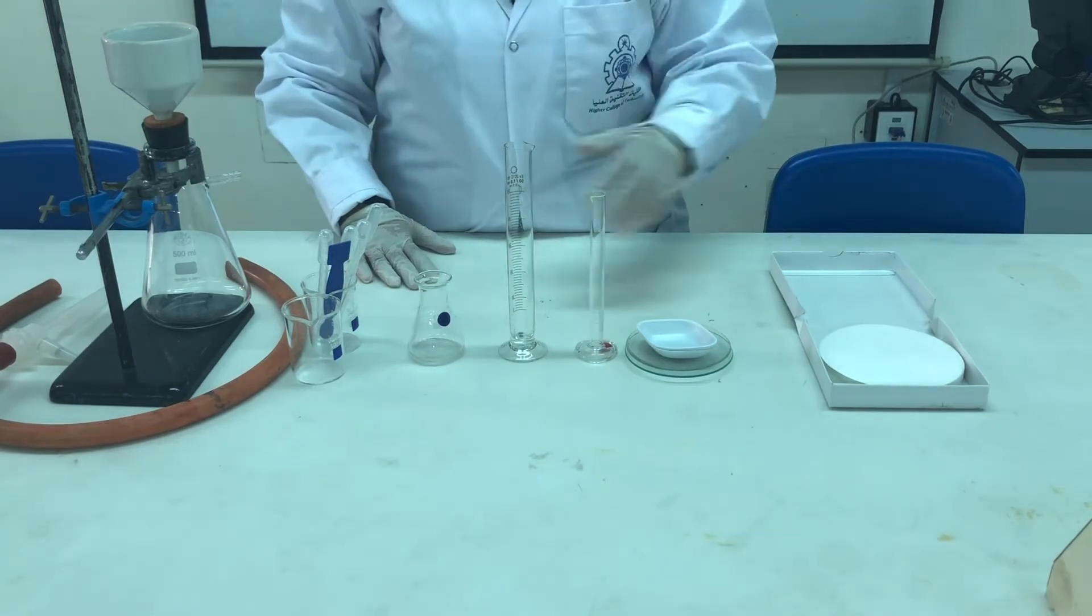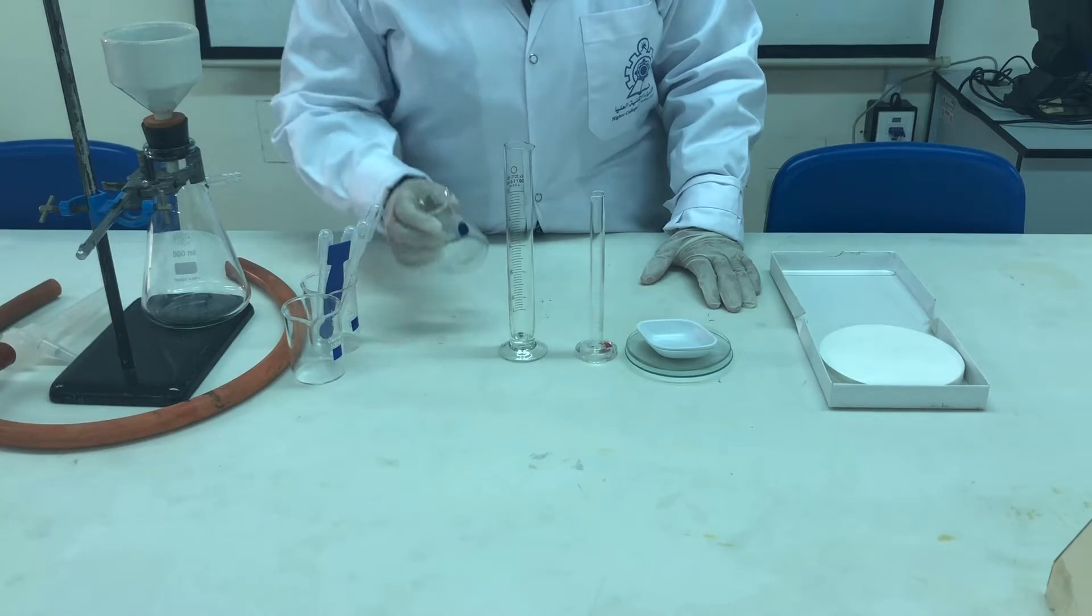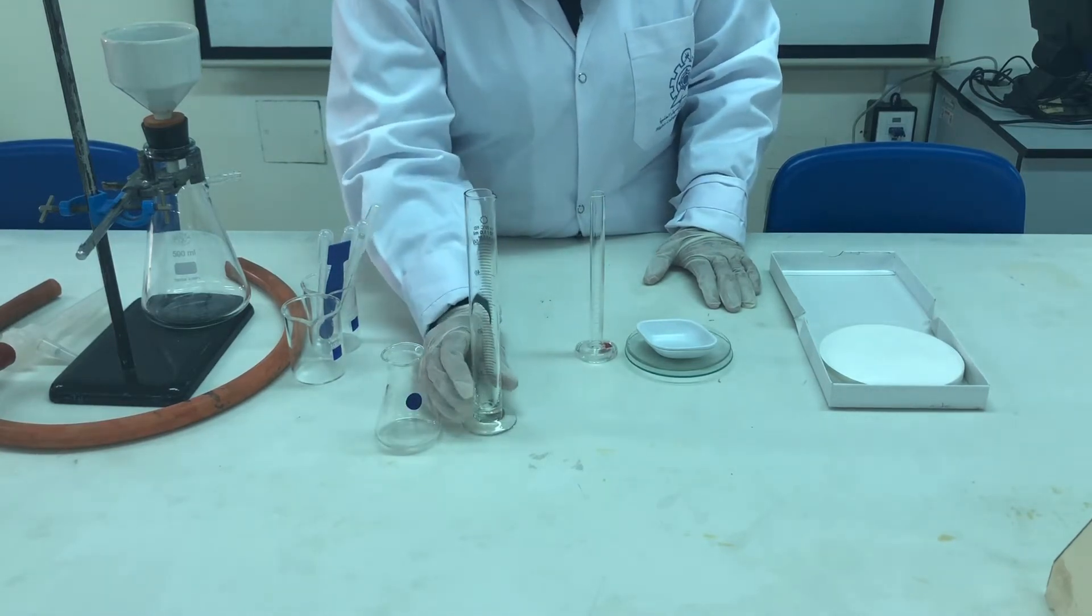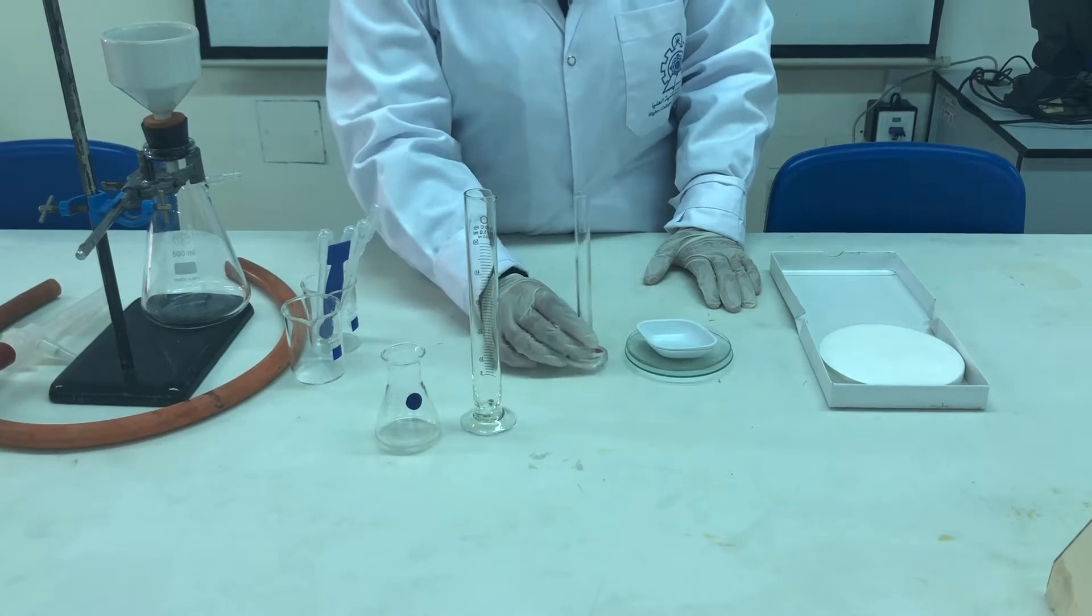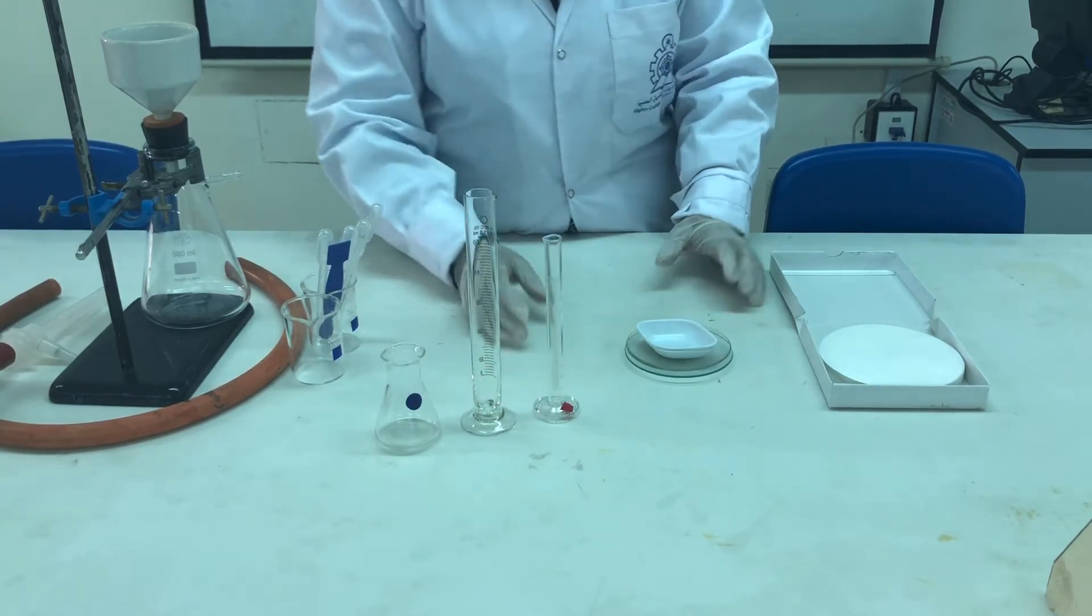As you can see here, these are the apparatus that we are going to use for this experiment. As you know, this is the conical flask. This is the measuring cylinder, which is about 50 ml, and this is also the measuring cylinder which we are going to use.